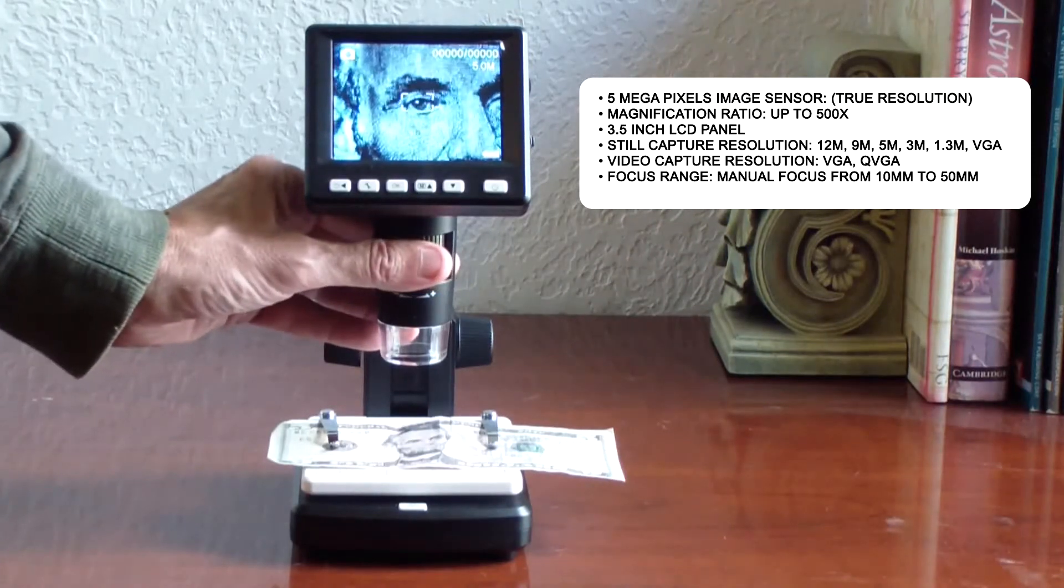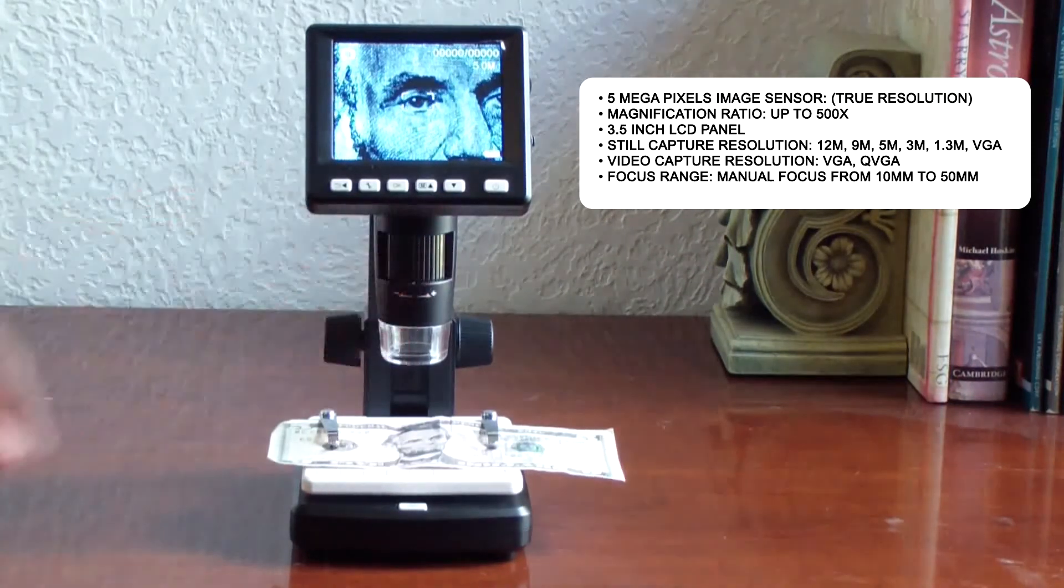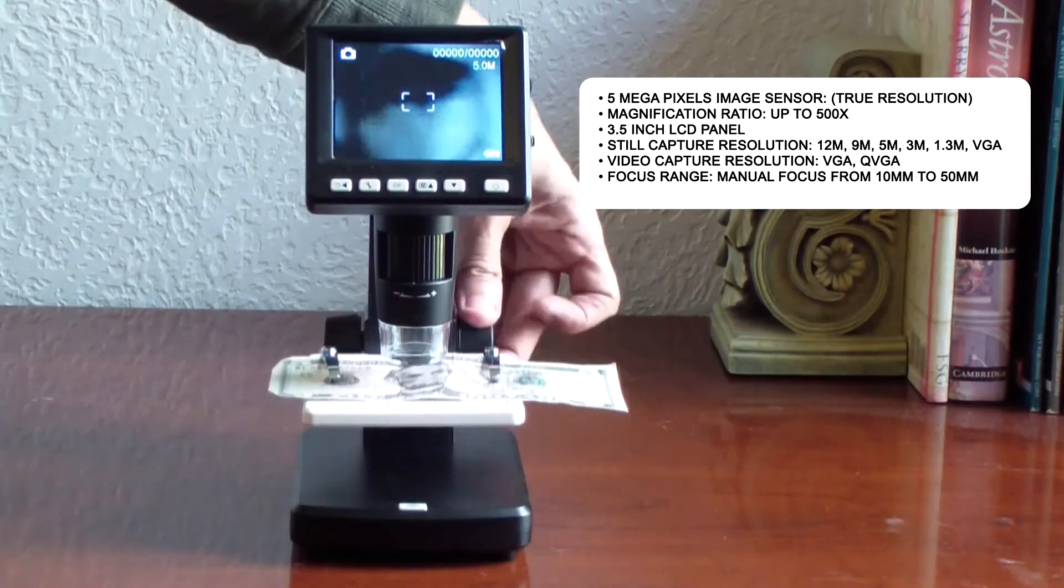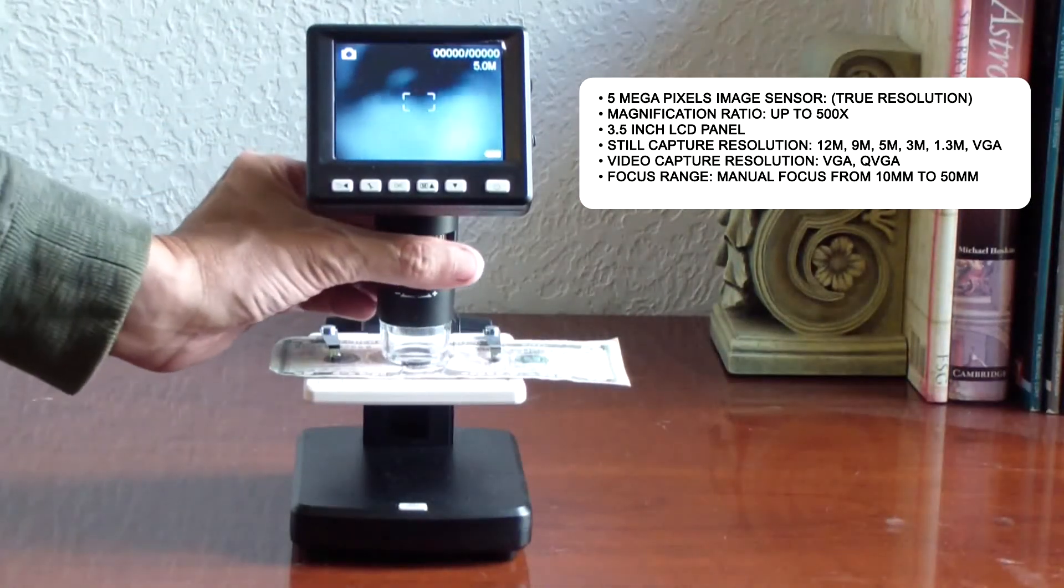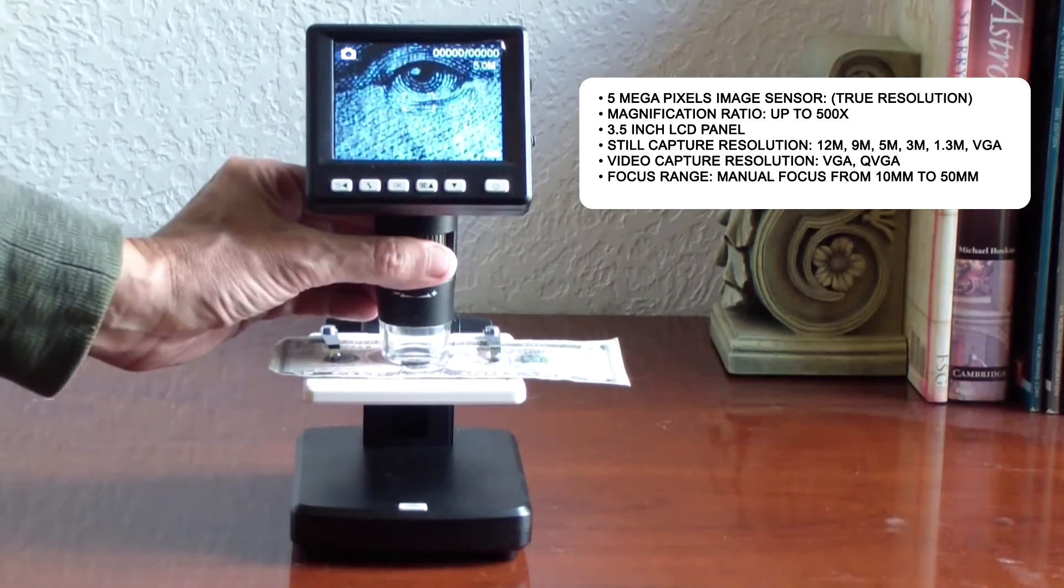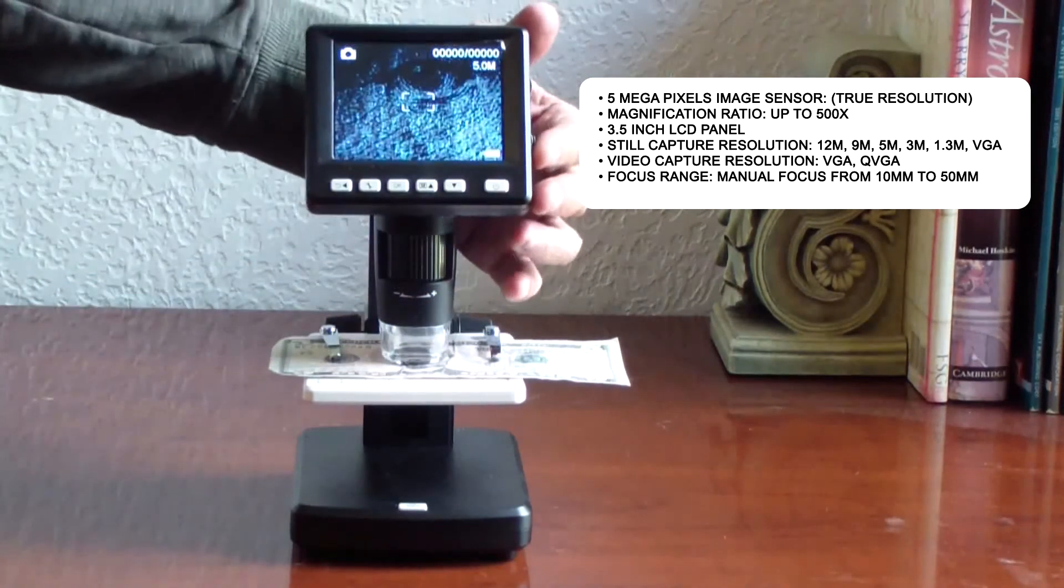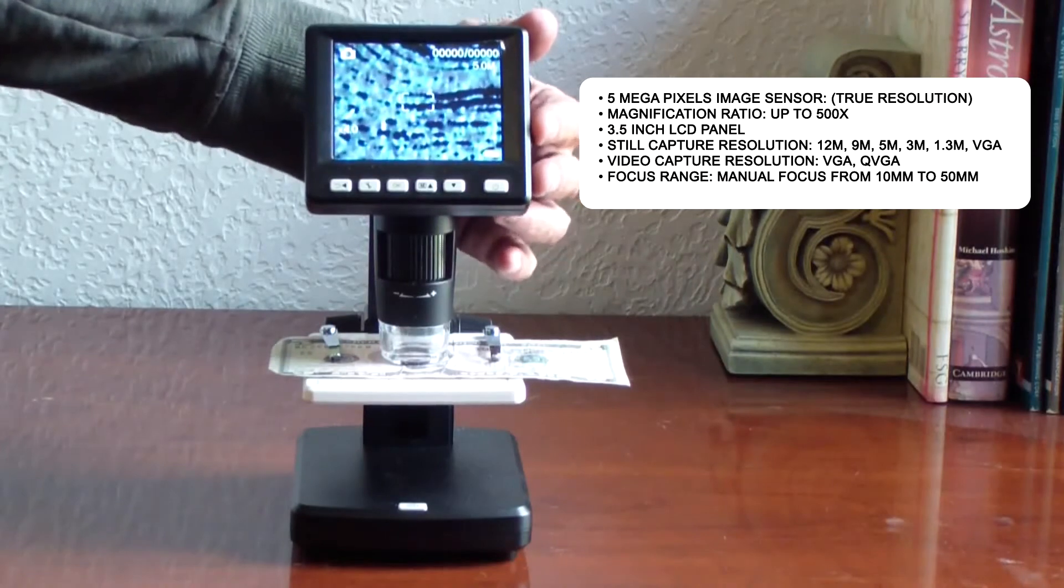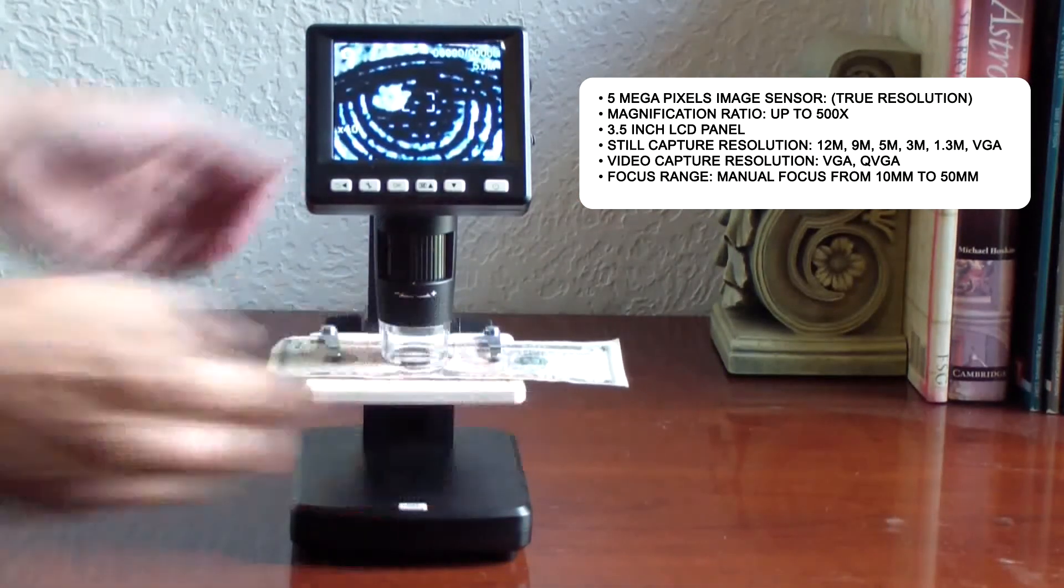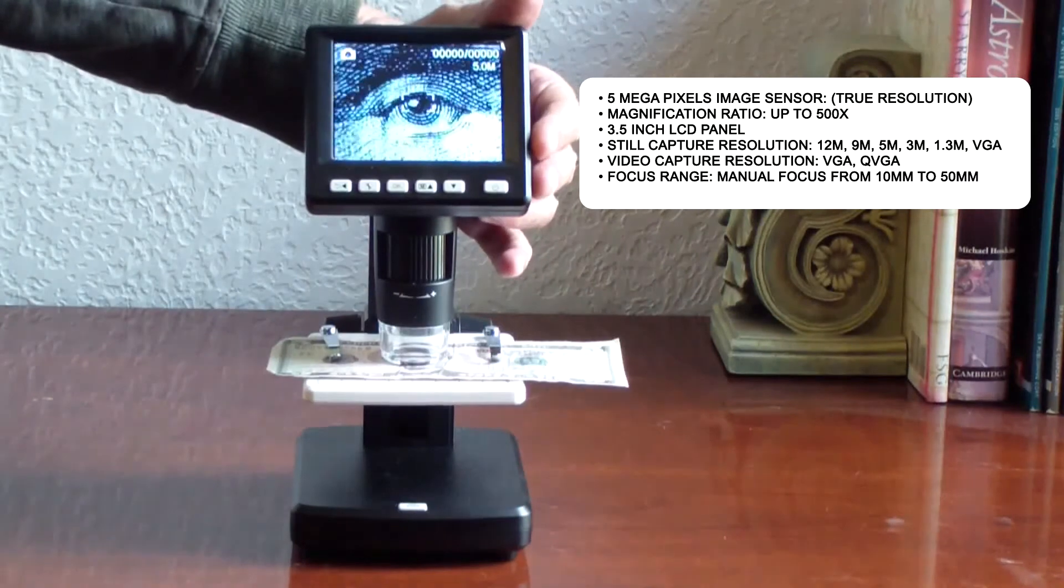Connect via the USB connection for preview on the screen, or connect to a large TV or projector through the AV out port. The USB connection and micro SD card slot also serve to transfer images and video of your observations to your computer for sharing via email, social media, or for editing and printing.